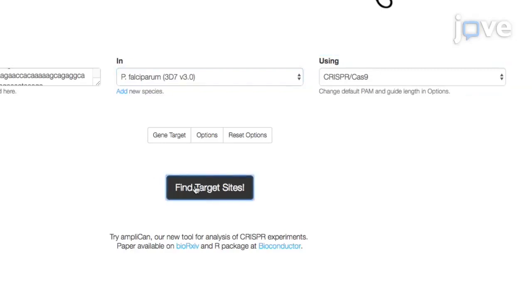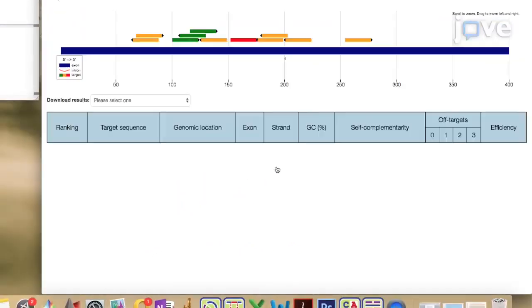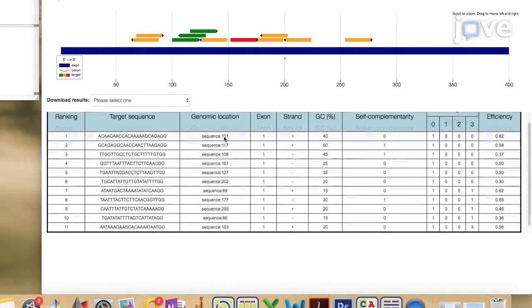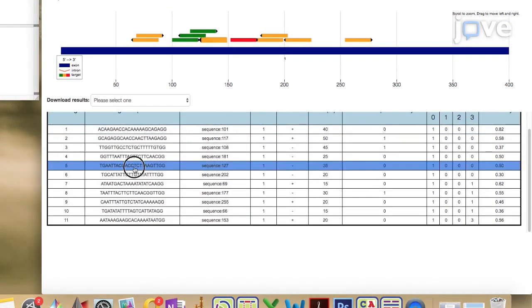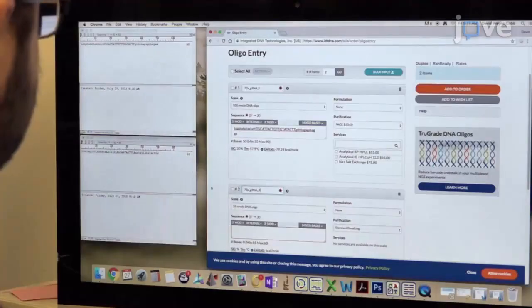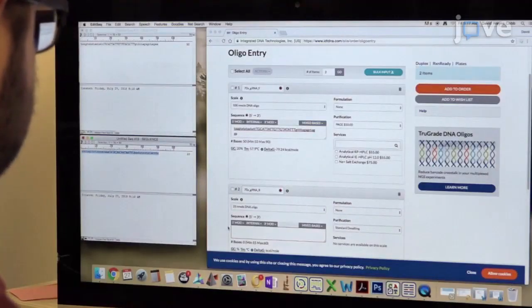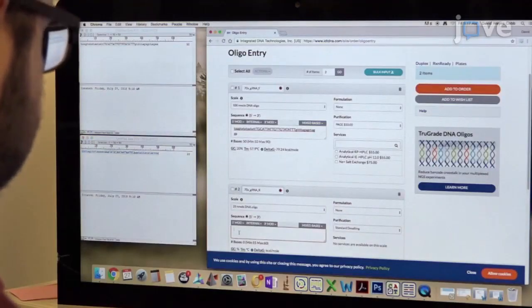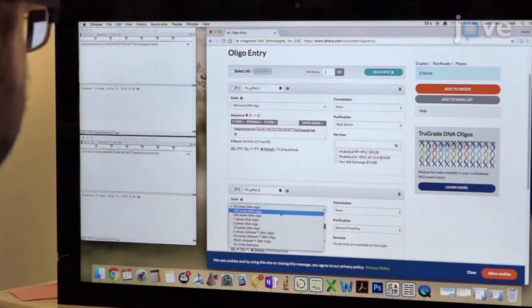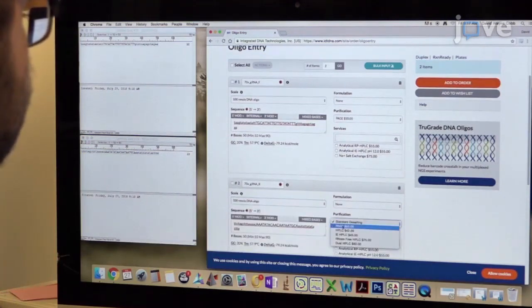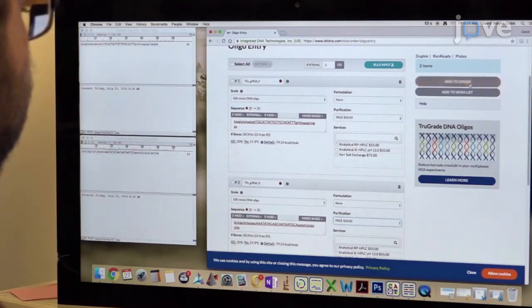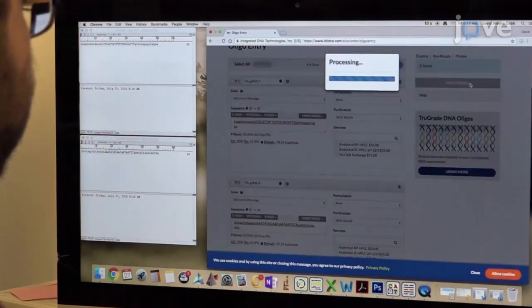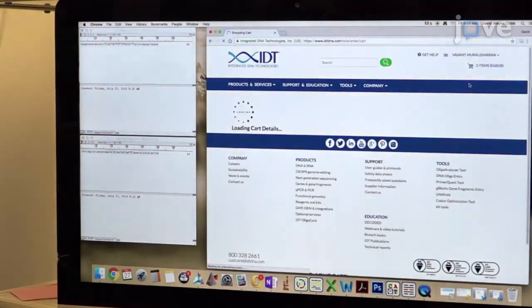Next, click FIND TARGET SITES. Select a gRNA sequence from the options presented, giving preference to the most efficient gRNA that is closest to the site of modification and that has the fewest off-target sites. Purchase the gRNA sequence and its reverse complement as polyacrylamide gel electrophoresis purified oligos. The gRNA sequence used to target PFH-SP70X can be found in the text protocol.